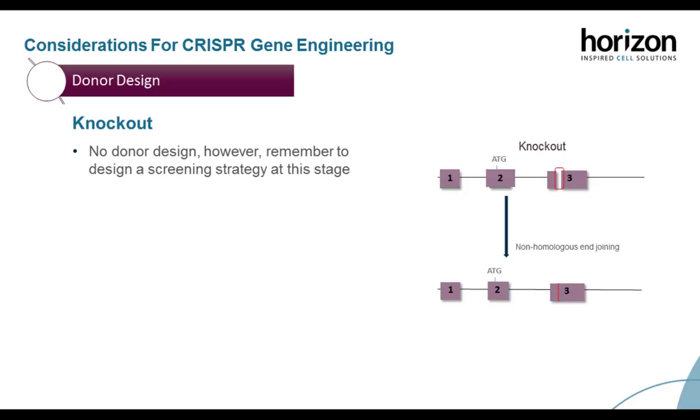So this could be a restriction site, or maybe a specific DNA region that you can amplify up later on, or if your modification is going to have a different phenotype, you should be thinking about screening yourself based on that phenotype.